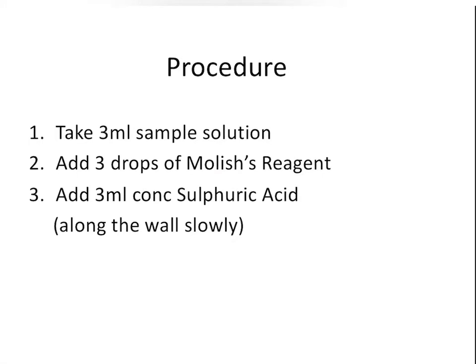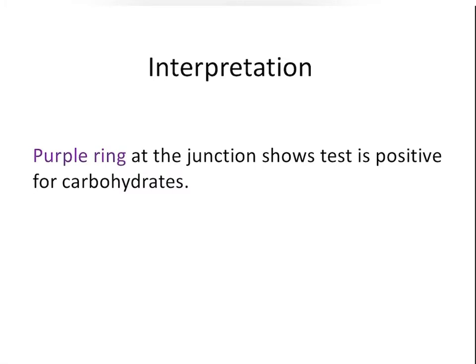Take 3 ml of sample solution in a test tube, then add three drops of Molisch reagent. Then 3 ml of concentrated sulfuric acid is added slowly along the walls of a tilted test tube. You will see the formation of a purple ring at the junction of the two liquids, which indicates the presence of carbohydrates in the given solution.